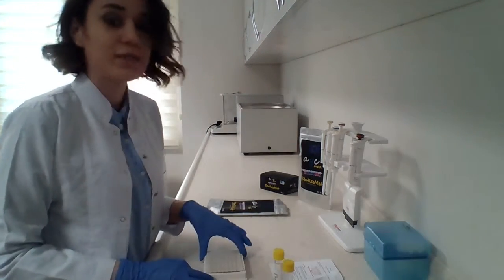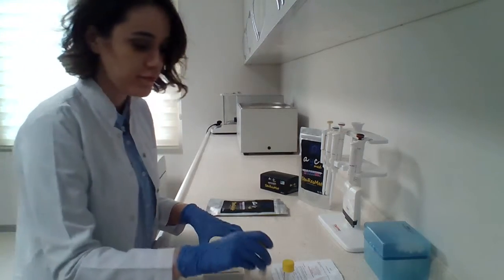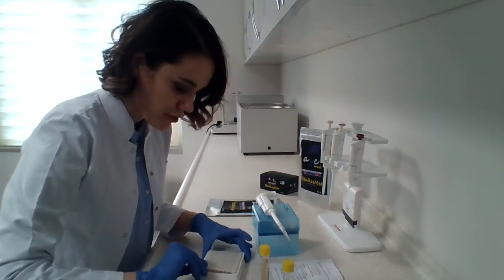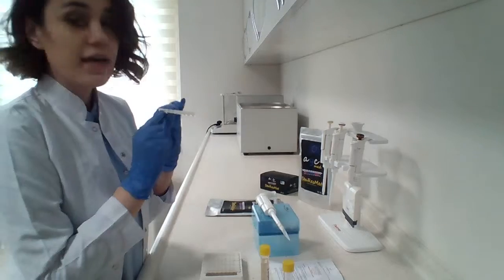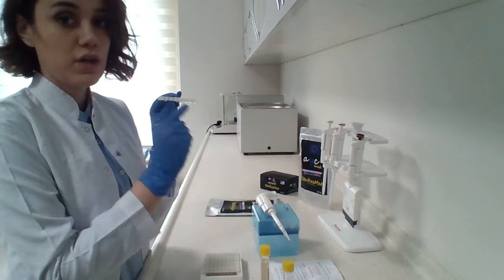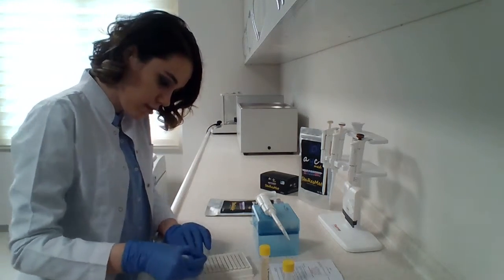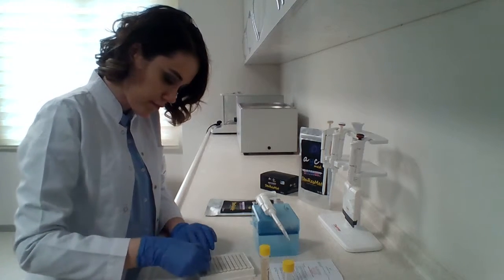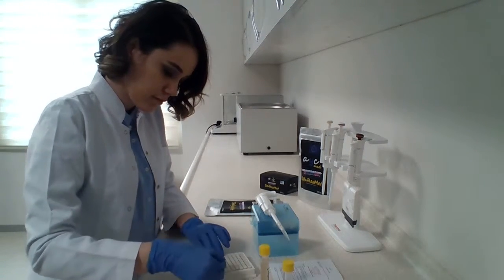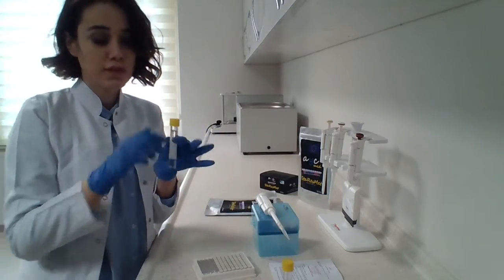First of all, we're going to start with adding 100 microliters of solution 1 to each well that we're going to use. In order to start, we can take the strips in our hands and we can see the arrow side. So it will start from this side to this one. You can see the arrow on top of the strips. And we peel the cover. And then we will add 100 microliters of solution 1 to each well.